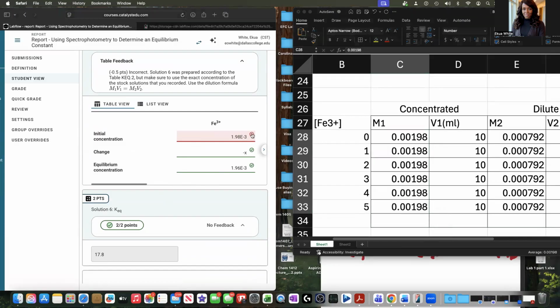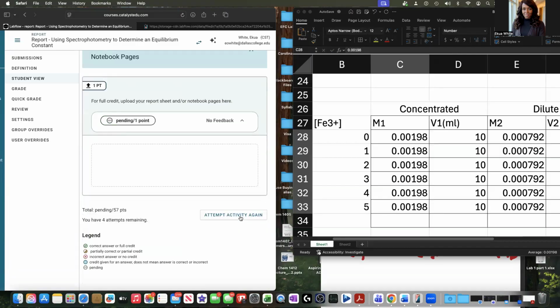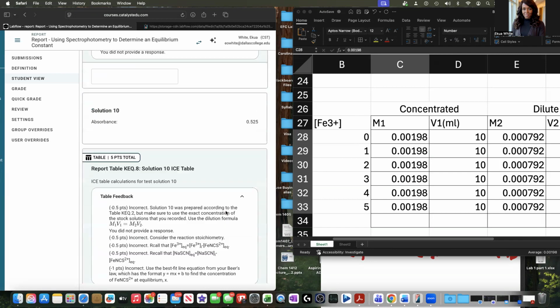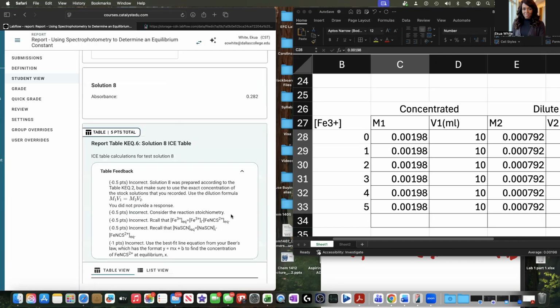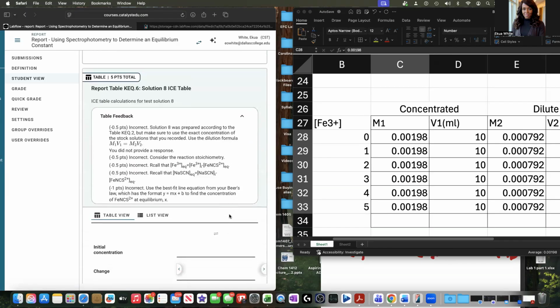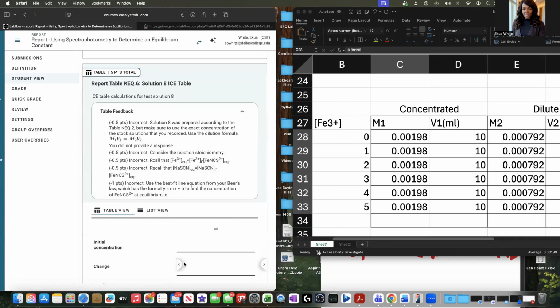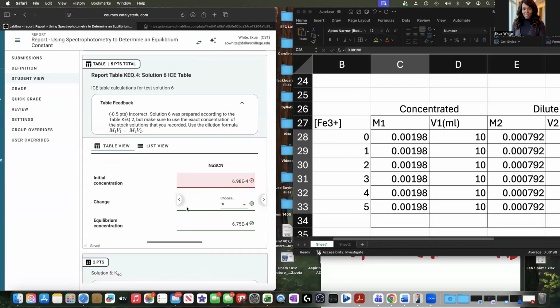And so for this one, then, I guess let me try to fix the mistakes I made. Okay, so I'm only writing over the sections where I missed, right? I'm gonna start. Mind you, I have shortened the video by getting to the point. So this is the part where I messed up for 6. Okay, test solution 6.